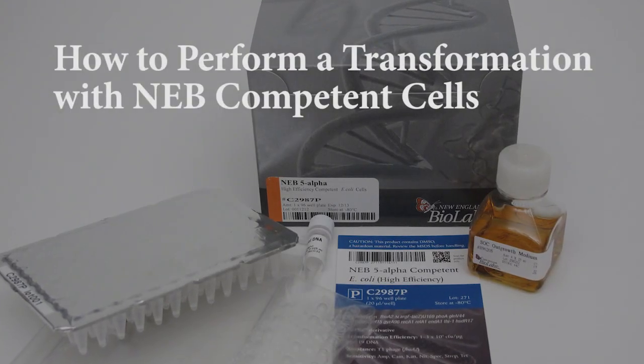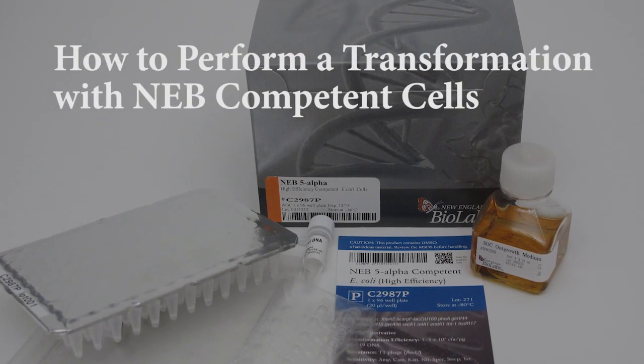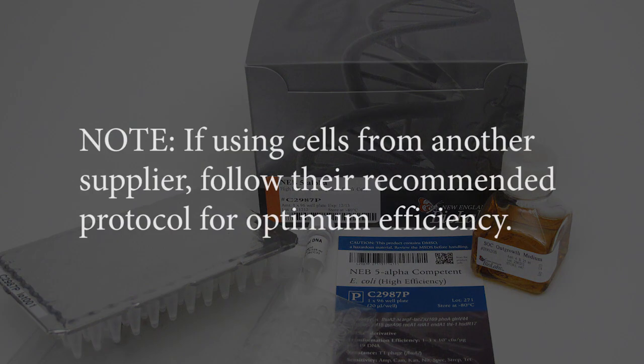The following transformation protocol is recommended for use with New England Biolabs' competent cells. If using competent cells from another supplier, we suggest following their recommended protocols for optimum transformation efficiency.